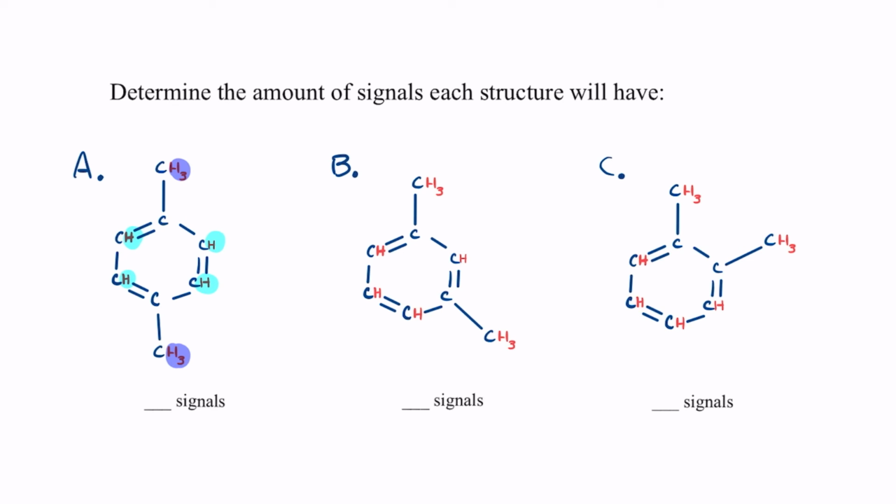And you might be a little confused by that, but remember when I told you there were two planes of symmetry going down the middle this way. And so this hydrogen environment has the same chemical connectivity as this one. If we look at this one, for instance, we see that it's attached to another CH group and this carbon along with this methyl group.